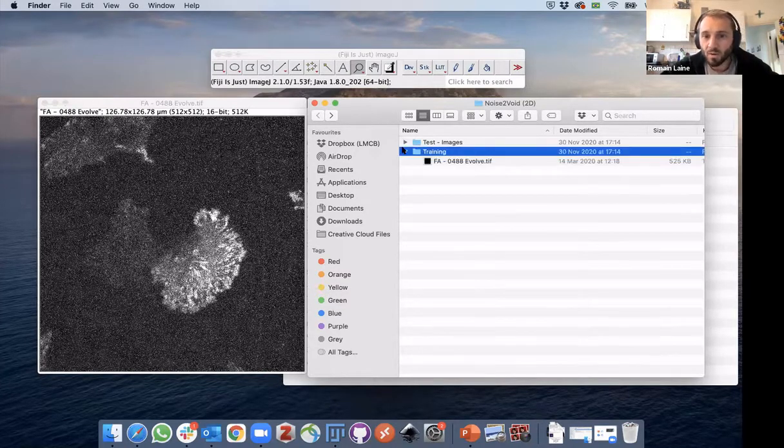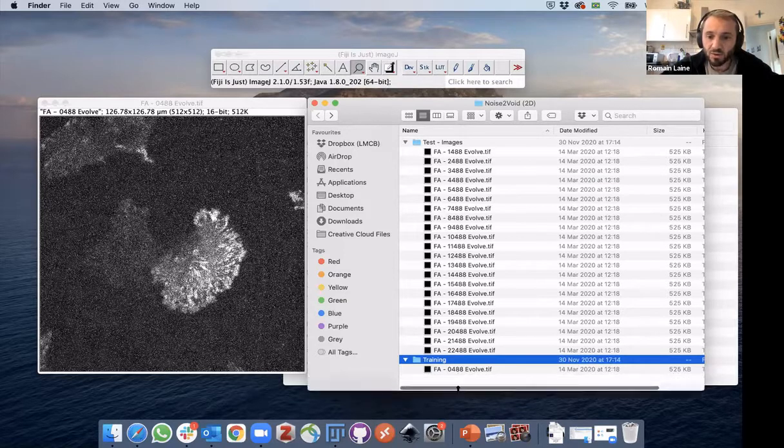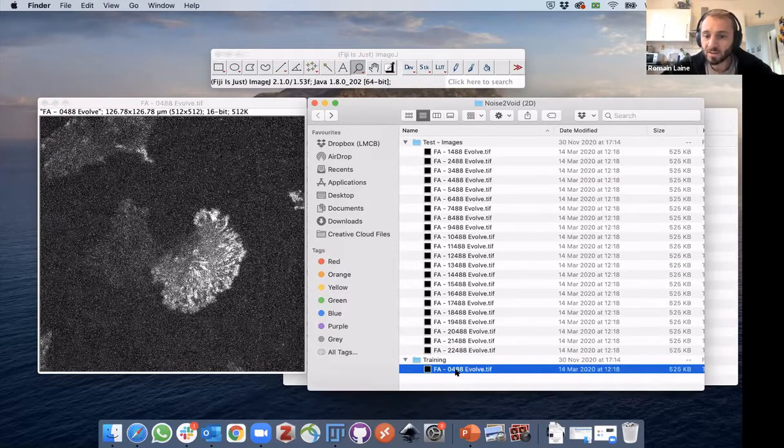But only from, say, one of the frames of our very same time course series, denoise the rest of the time series. Okay, so that's what we'll be doing. In practice, we could use more frames as training data set and then apply it to the rest of it. But just for today, just to show you the strength of this approach, we'll be training only just one frame and then applying it to the whole stack and recover a denoised stack afterwards.